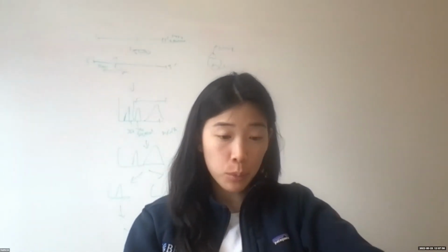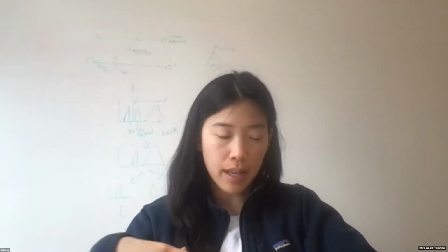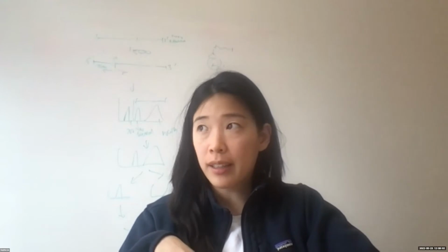Great. There's a follow-up question on what method could be better than the others. When you're thinking about doing a spatial experiment, how important is having a single cell reference, and all these other parameters as you go into it, so that you can optimize your preparation to have the best results in your data?